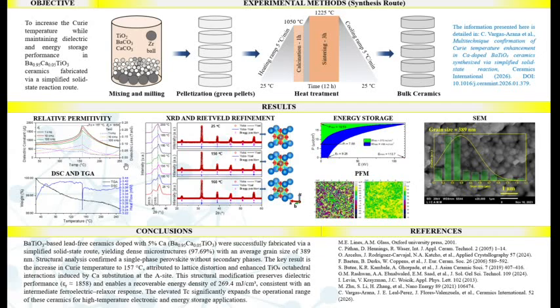First, thermal analysis. TGA on the precursor powders showed the reaction was essentially complete above 926 degrees Celsius, and for the sintered ceramic, mass loss was practically negligible, so the material is thermally stable. More importantly, the DSC curve showed an endothermic peak at about 155 degrees Celsius, corresponding to the ferroelectric to paraelectric transition. That's in excellent agreement with the 157 degrees Celsius we saw dielectrically.